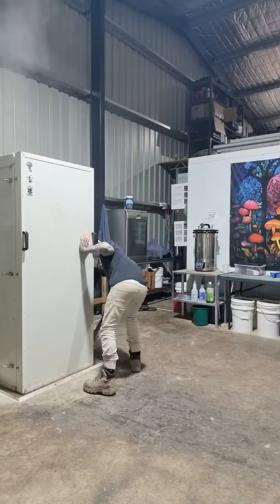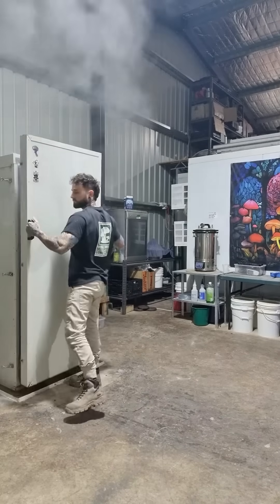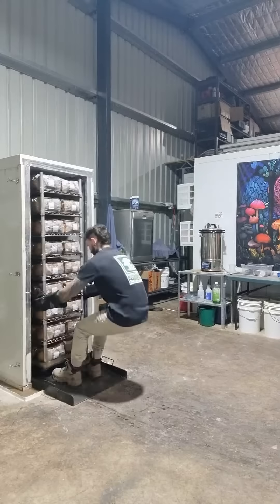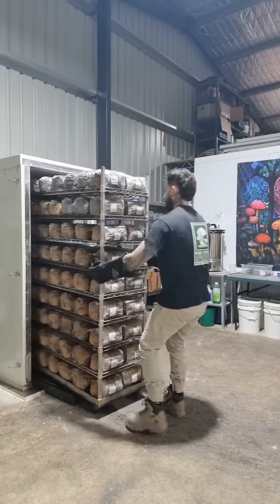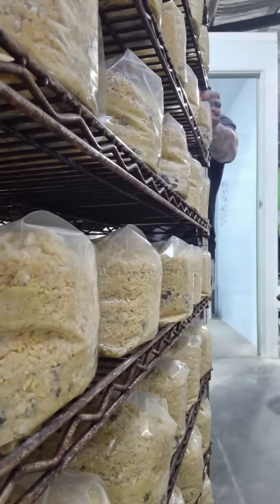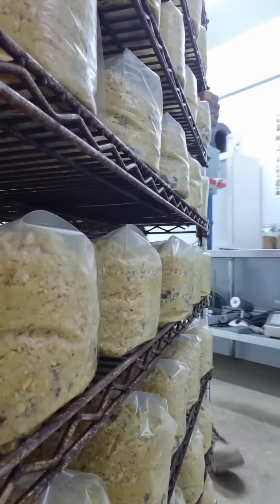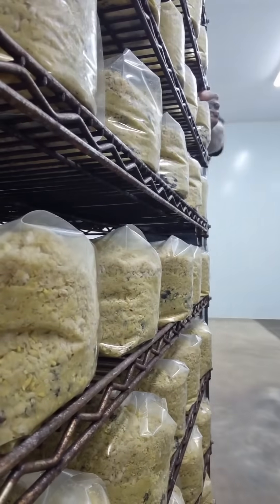Once the cycle's finished we open the sterilizer up, let all the steam out, and then we unload the sterilizer while the blocks are still hot and move them into our lab to cool down under HEPA filtered air. We leave them in there to cool down overnight, and then the next day we come into the lab and do our inoculations.